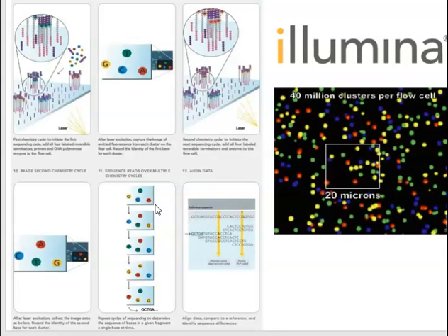And what we really need to then understand is that we have a forward read, then we have a reverse read, and data from those two clusters are then compared. If they are exactly the same, as in direct antisense of each other, then that will be a good clean read. If there's differences between the two, then the data can be discarded. So there are just additional checks that are taken into account.